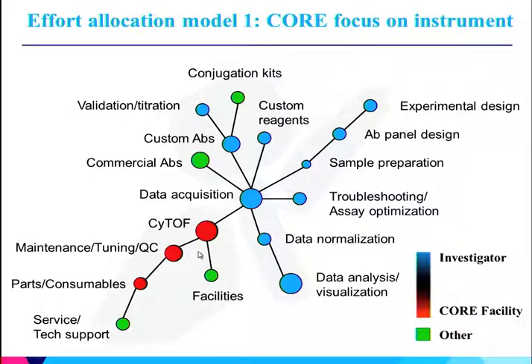There's daily cleaning of the nebulizers and the lines. There's weekly cleaning of other glassware. Every part of this machine is made of a tiny, fragile piece of glass, so you need to have good hands for the whole process. And then you also need a really good repository of parts and consumables, because there are regular bits that need to be tweaked and replaced.